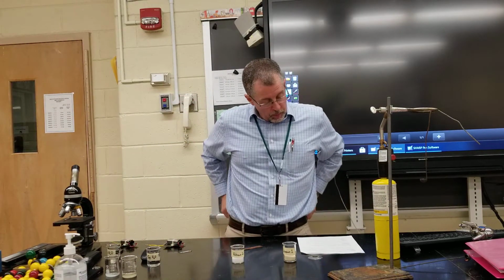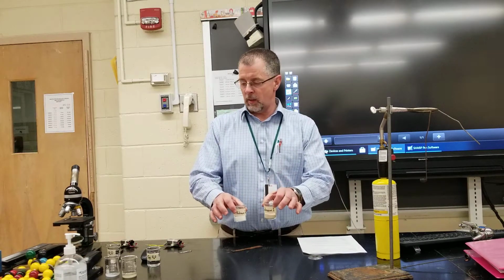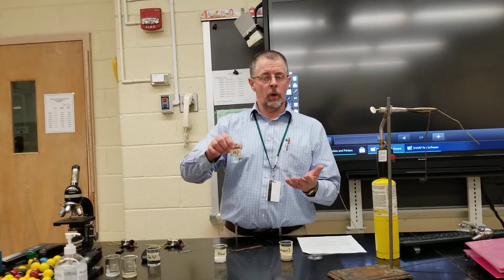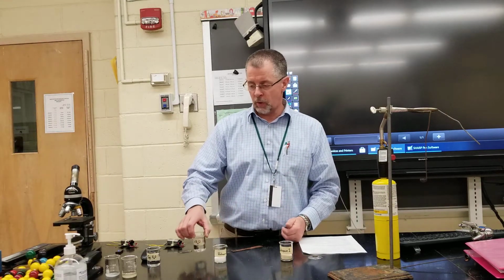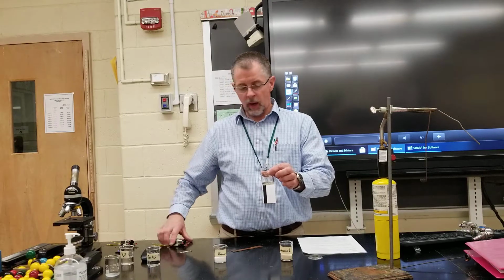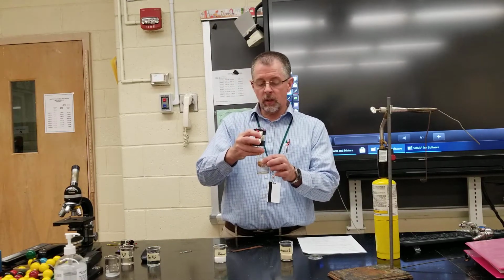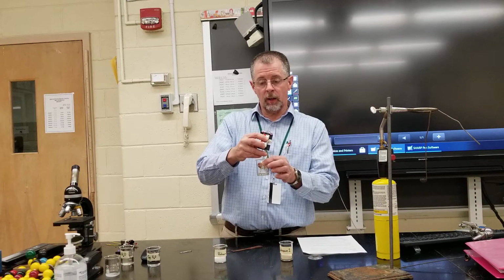Okay, the next step would be to dissolve the solid. So we're going to see if they conduct when we dissolve them. To do that, we're going to use the deionized water again, because I want to make sure I'm not introducing ions into the dissolved solution. So when I dissolved number 1 with deionized water, I see that it does not light up. In other words, it did not produce ions.